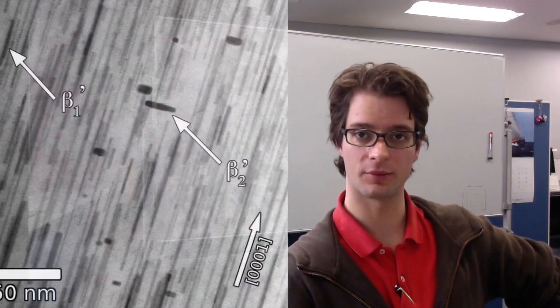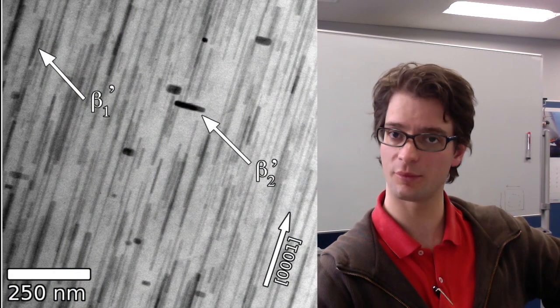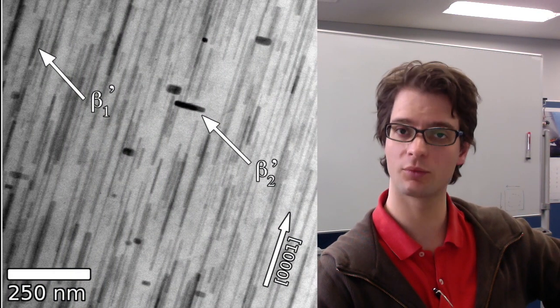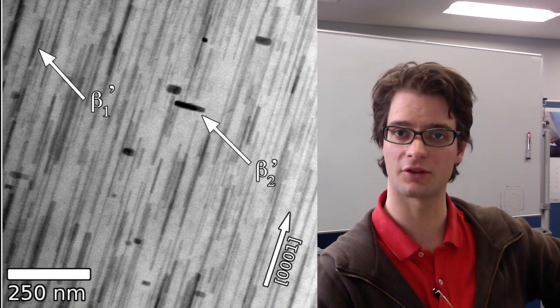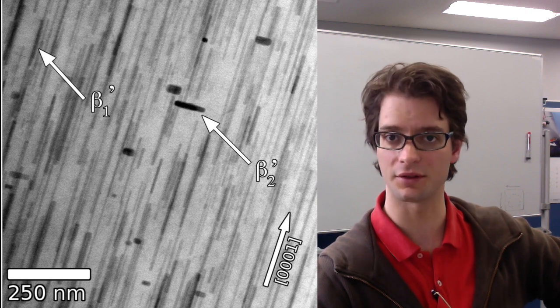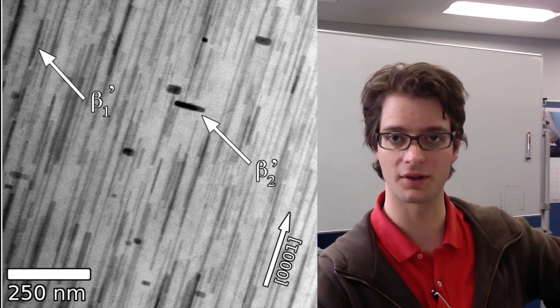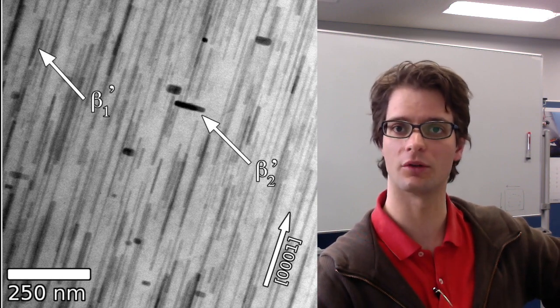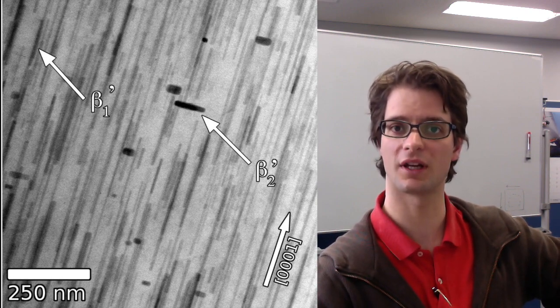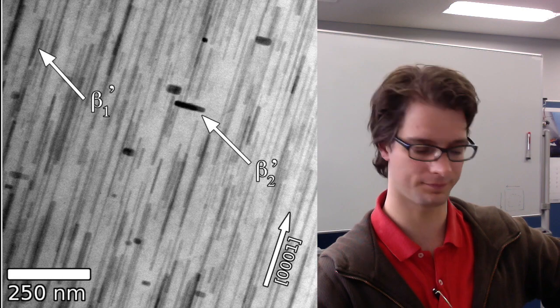When we look at the electron micrograph of the sample however we see that these scatterers are cylinders and not spheres. So we need a different scattering model for this scattering pattern.